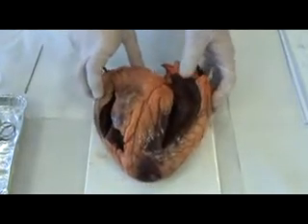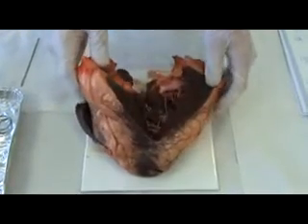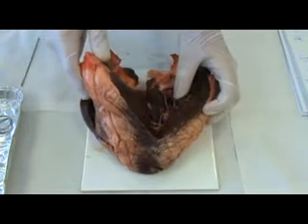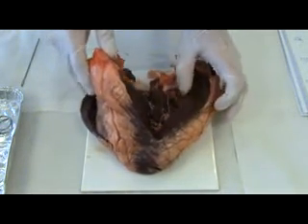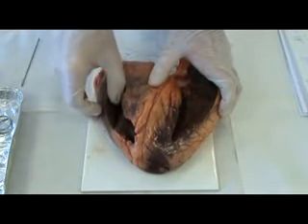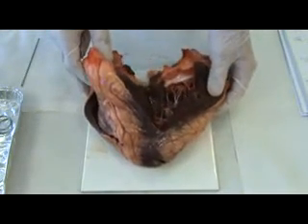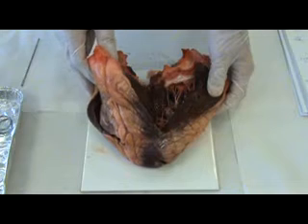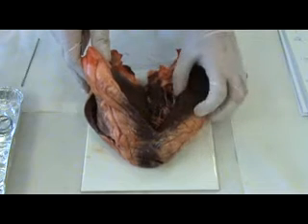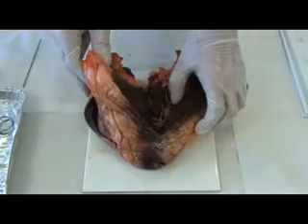If we look at the myocardium of the heart, by opening it there, the left side of the heart has a very thick wall, so the myocardium is very thick there, compared to the right side of the heart, which has a much thinner wall. The left side of the heart has to pump blood systemically, so the left ventricle has to create enough force to pump blood throughout the body, hence the thickness. The greater the thickness, the greater the power generated during contraction.